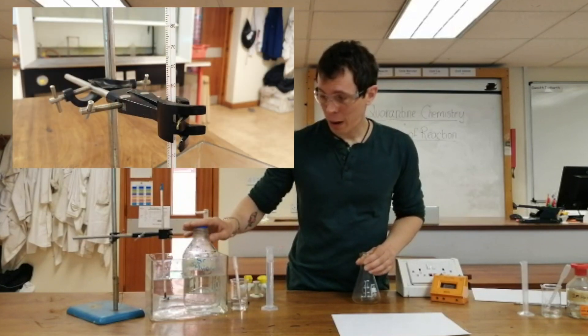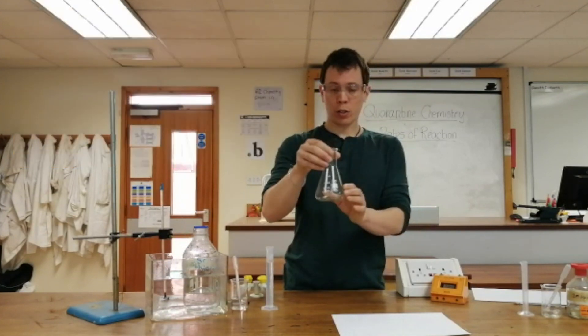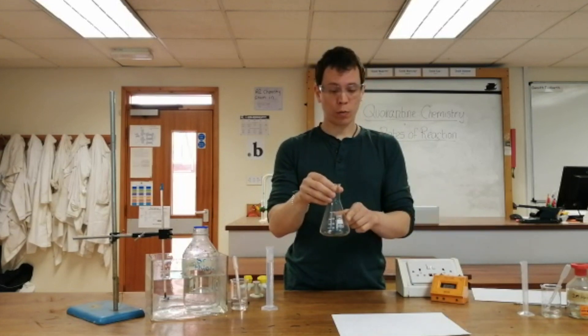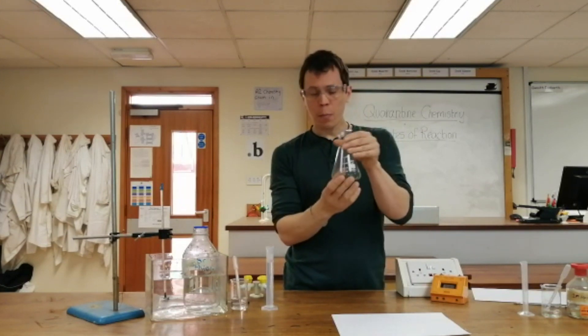I'm going to measure out 25 centimeters cubed of sodium thiosulfate, pop it into a conical flask, and then measure out 5 centimeters cubed of hydrochloric acid. I'll pop that in the conical flask and they will react together, form the tiny particles of sulfur, and our mixture is going to start to become cloudy.